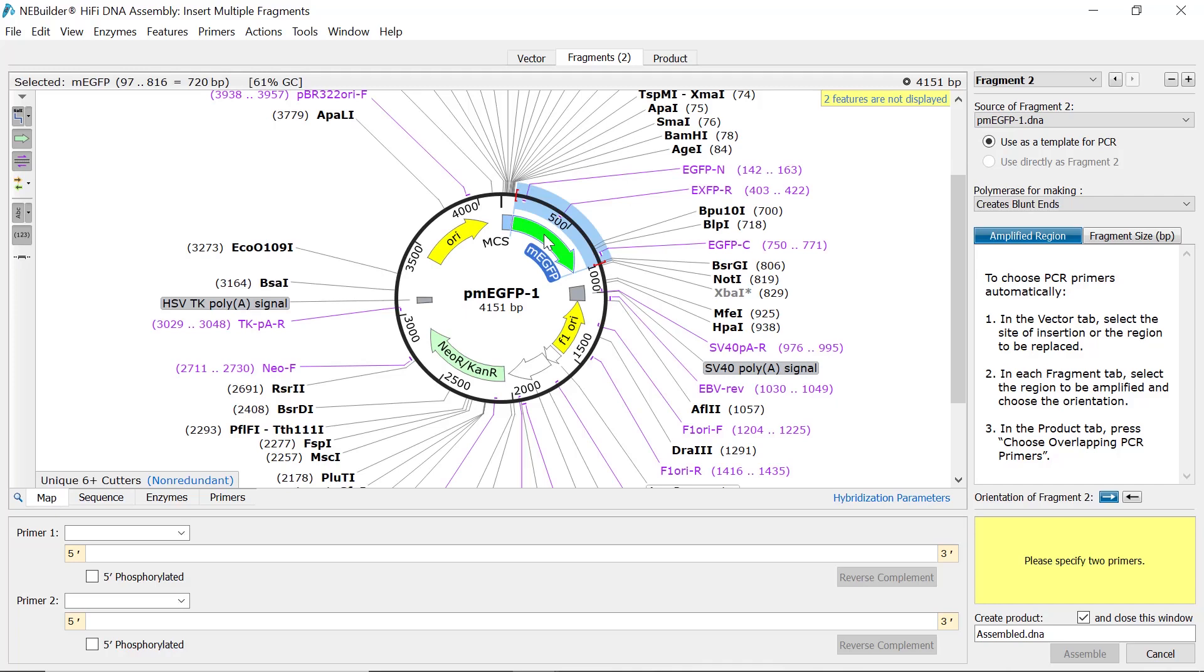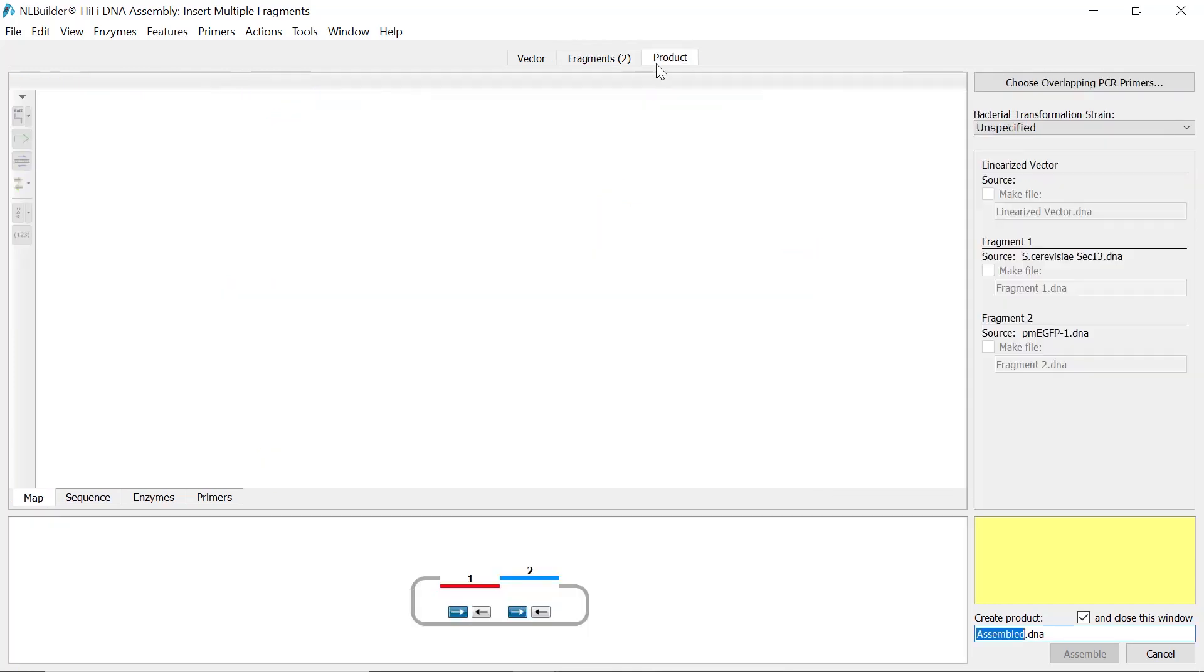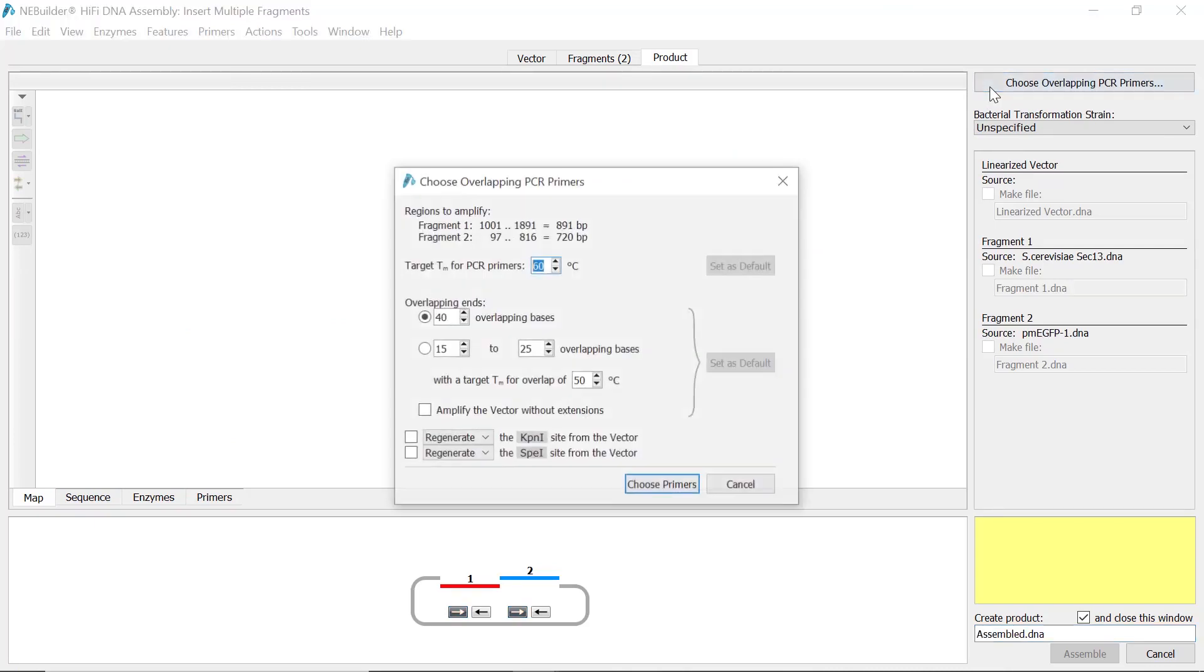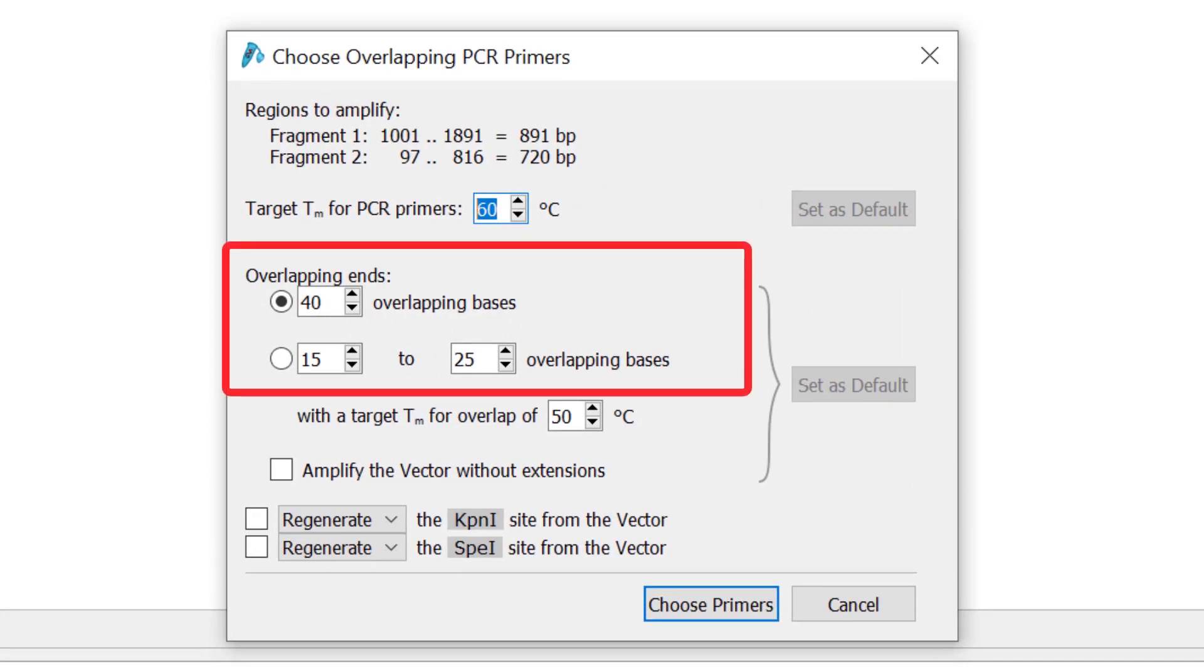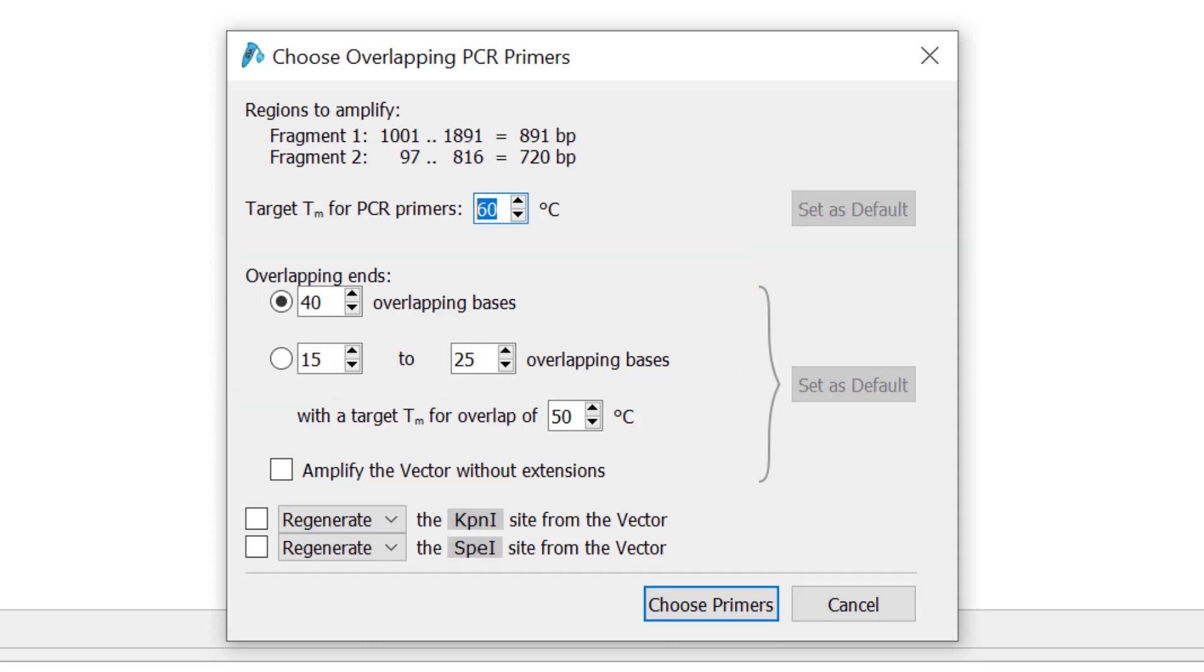With the fragment sequences defined, now switch to the product tab and select the choose overlapping PCR primers button. In the new window, set your desired PCR primer melting temperature. You can also specify the desired number of bases for the overlapping ends, or a range of bases with the desired target melting temperature for the overlap.